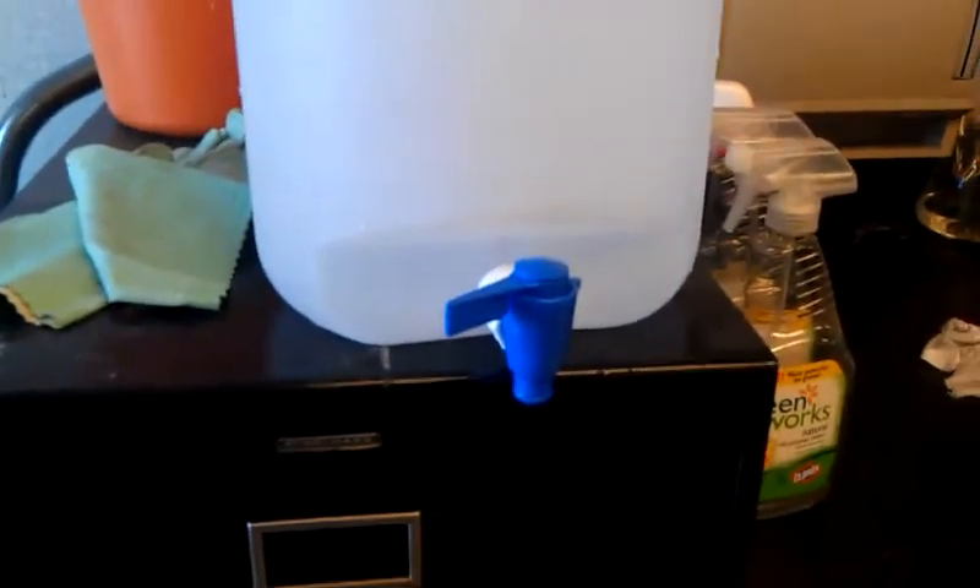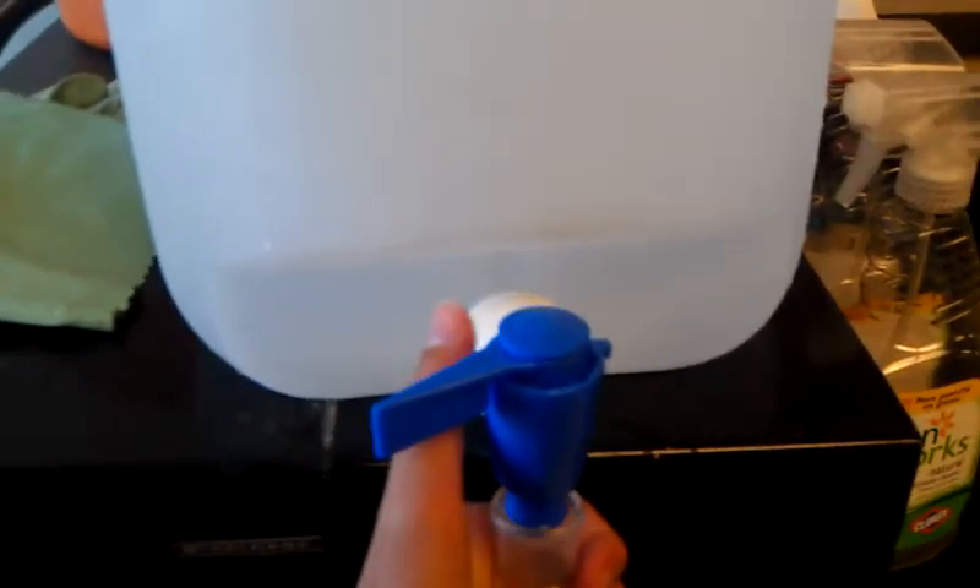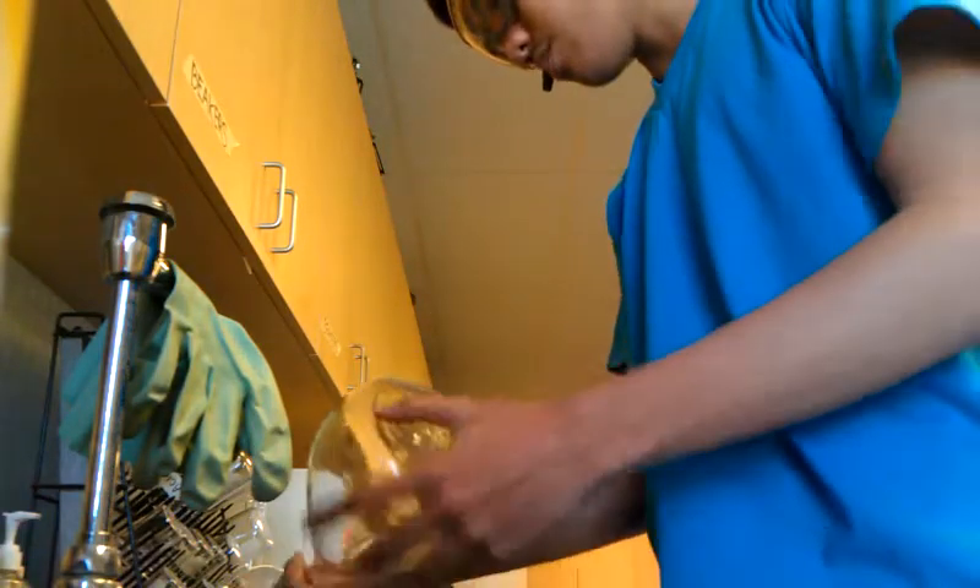Right after that, you want to grab some distilled water in order to remove the tap water. So as you remember earlier, I added distilled water and showed you how to add it, and right now I'm going to show you how to use it. Pouring in small amounts, as you can see. After that, you do the same thing — swirl it around like this — in order to get all the tap water out. Do it three times with small amounts.